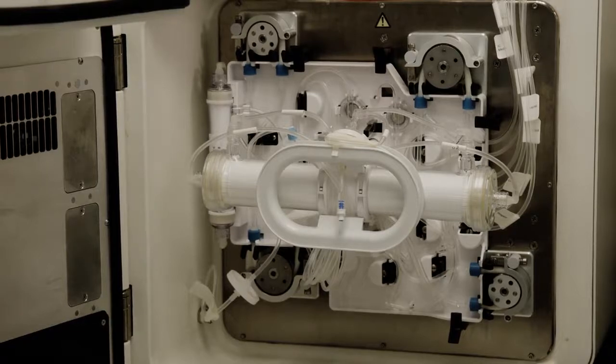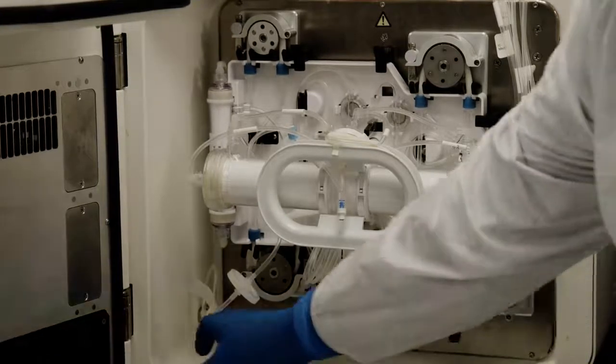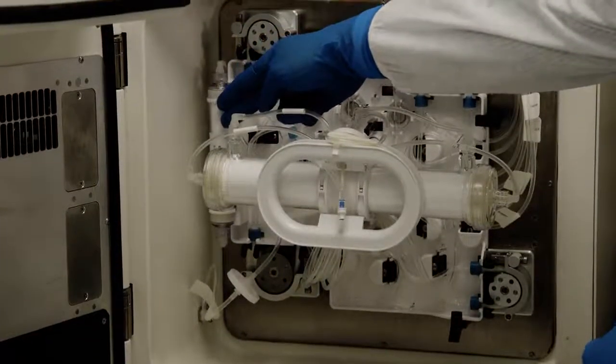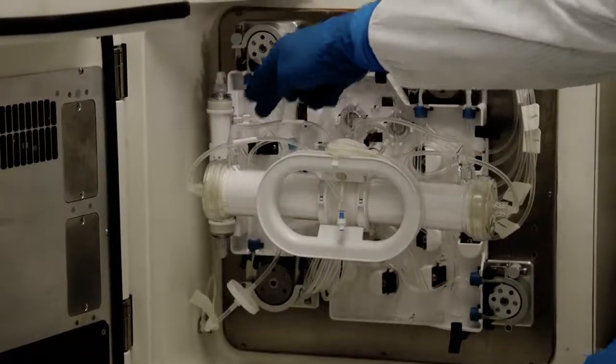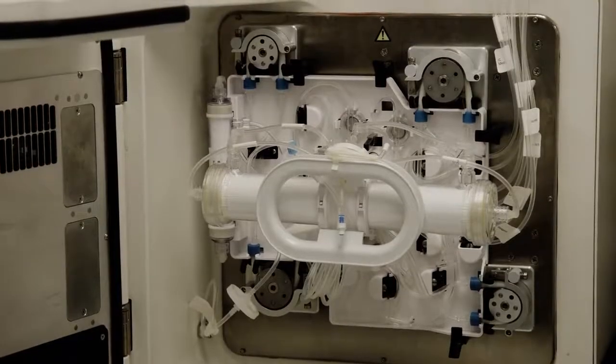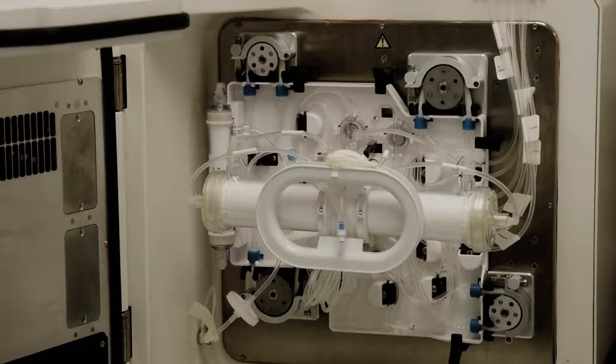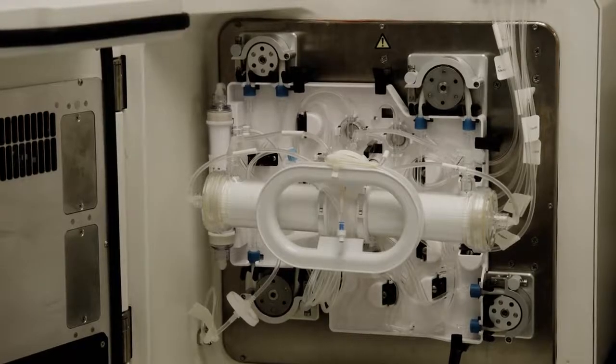Gas is fed from the gas tank into the disposable via the gas inlet line and into the gas transfer module of the GTM. Just like the bioreactor, the GTM here has hollow fibers that allow for maximum surface area for gas exchange into and out of the culture medium.